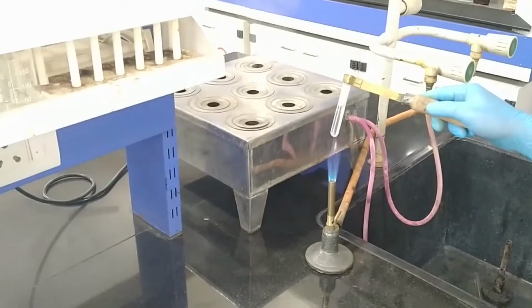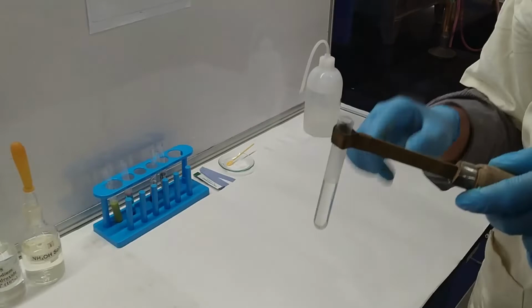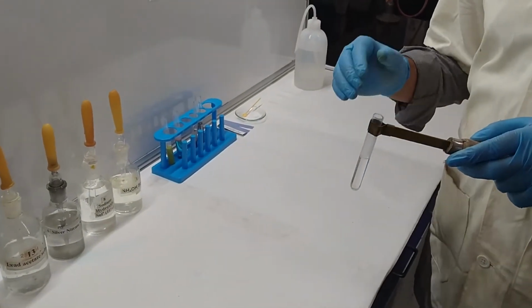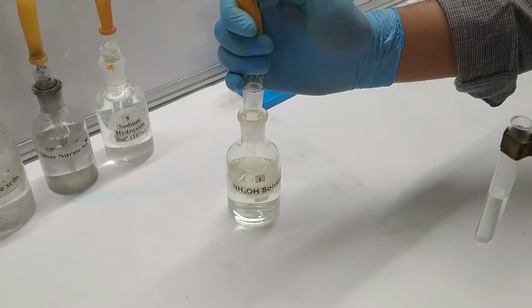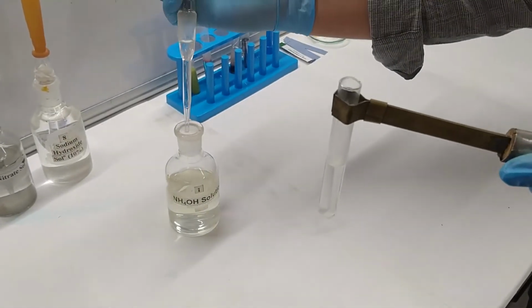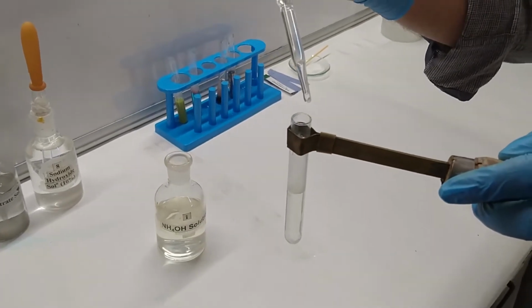The solution has boiled. So in this boiled solution we have to add some drops of NH4OH solution. So this is the NH4OH. I am going to add some drops, and while I am adding, this will give you a white coloration.